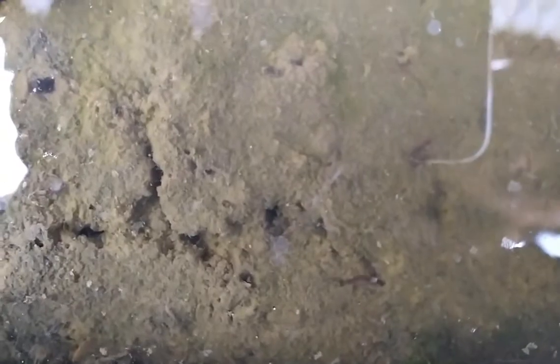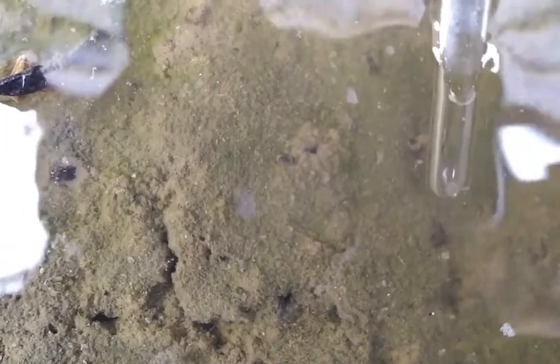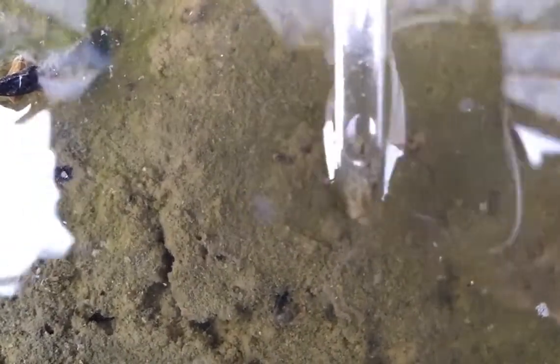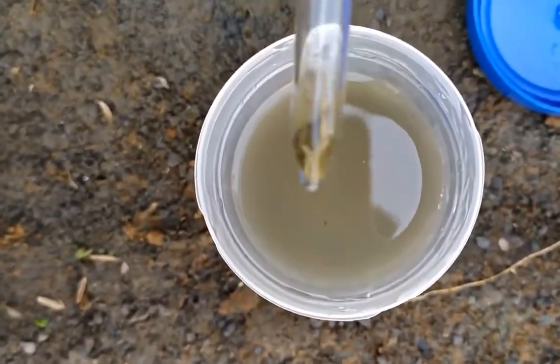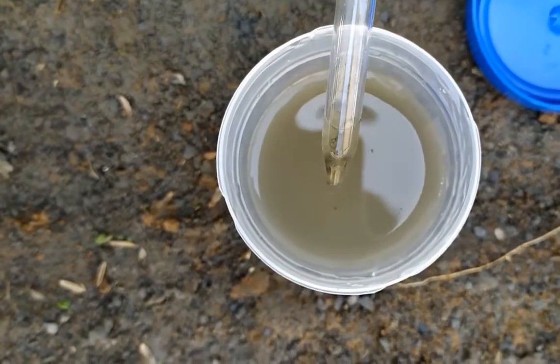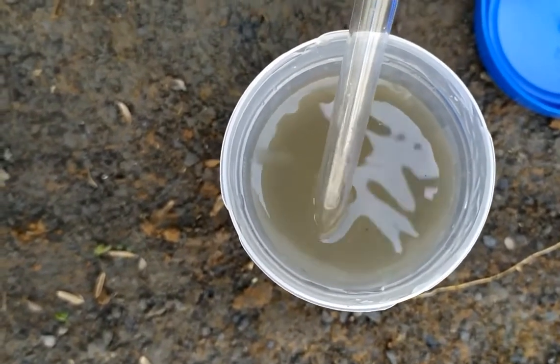First off, the larvae of the chironomous fly are collected from their natural habitat, which includes basically any stagnant pool of water with a medium to high level of decomposition. Droppers are used to collect the larvae as shown here. Chironomous larvae are about a centimeter long, can be seen wriggling in the water, and are easily identified by their blood red coloration, which is due to the presence of hemoglobin in their blood.